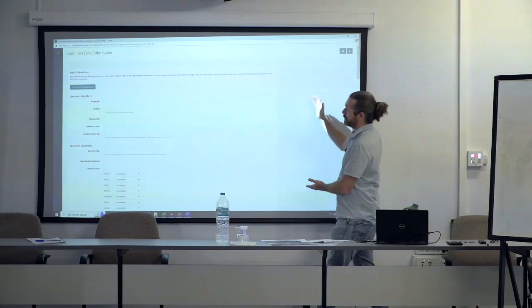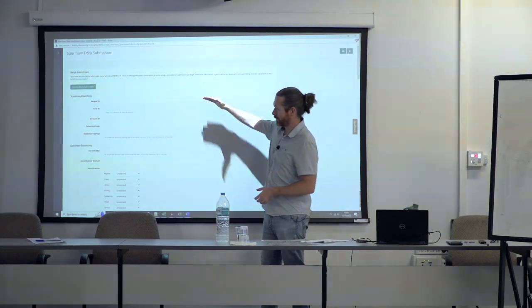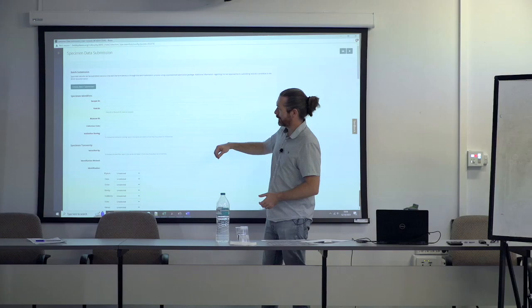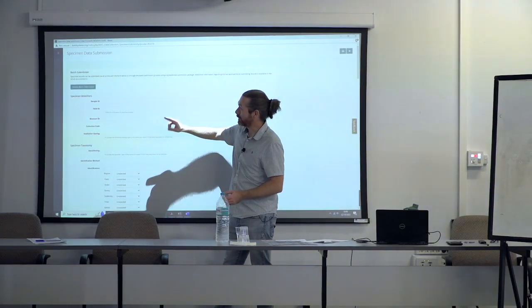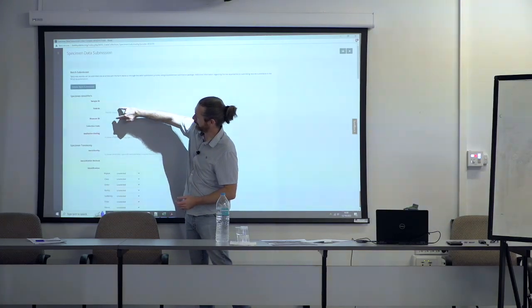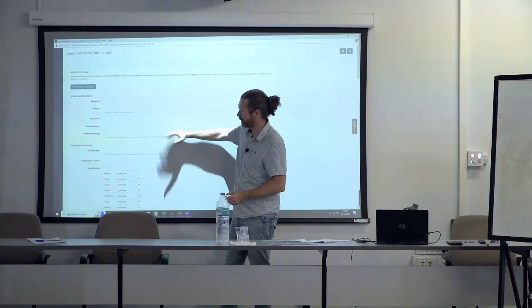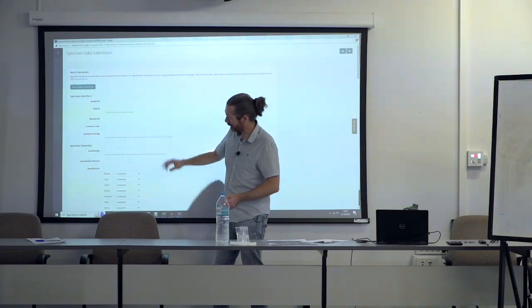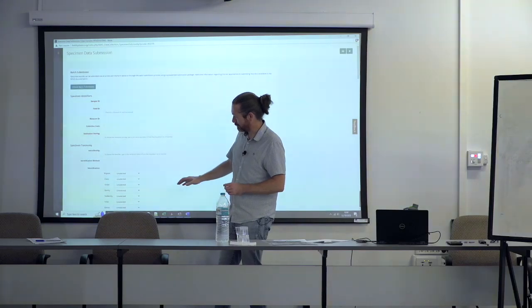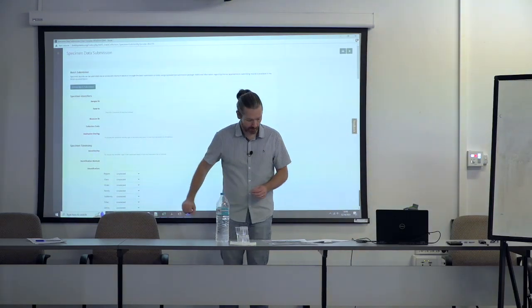So you get this page. If you're doing a single specimen or a few, it's very quick to just do them one at a time through here. The fields that are red are required, so you need to have a sample ID. You need to have either a field ID or a museum ID, and then you need to put in the institution where the voucher is being stored. Everything else, fill out as much as you possibly can, but phylum is the only thing that's actually required when it comes to the taxonomy.